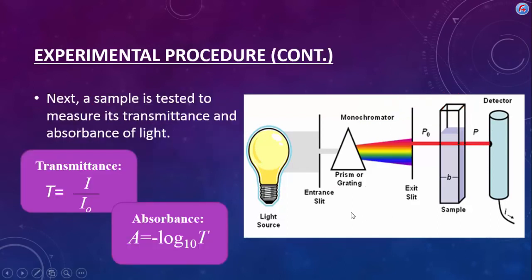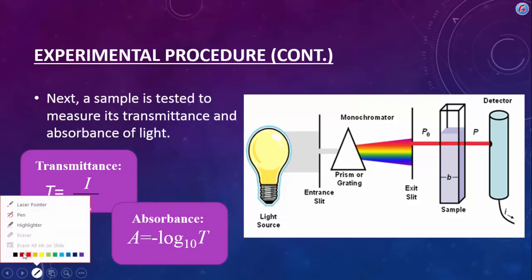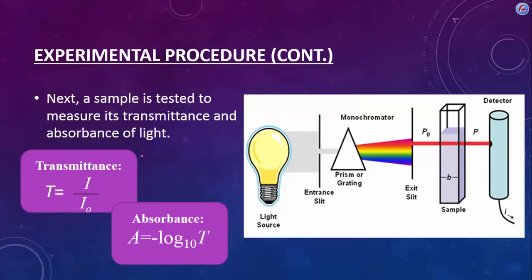All right, up next, let's talk about this intensity thing. We have a thing called transmittance. If you take the intensity measured, like that last problem you saw in the video, which was around 23 photons per second, and the original intensity, which was about 38, the fraction of those, whatever that decimal number is, is called the transmittance. We're not actually going to calculate this, just so you know.